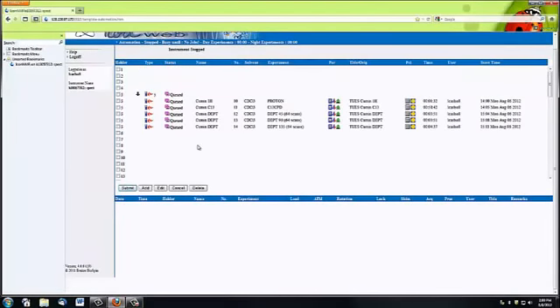And that's when you know that your experiments will be run, and when they're finished, you'll receive an email from Felix that will have your FIDs.